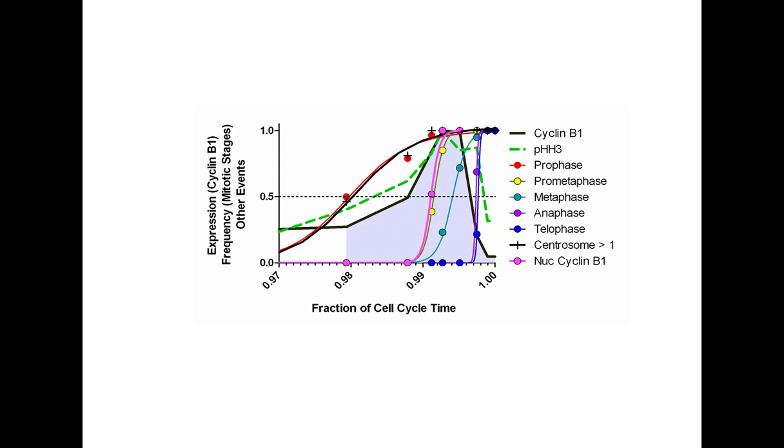Here, phosphohistone H3 expression and cyclin B1 density, or any other marker that we have included. And if we have imaging data, then we can do the same thing for other information by showing the time-related cumulative change in frequencies. For example, this plot shows the parameter expression profiles and reveals the variation in entry or passage through the mitotic stages.